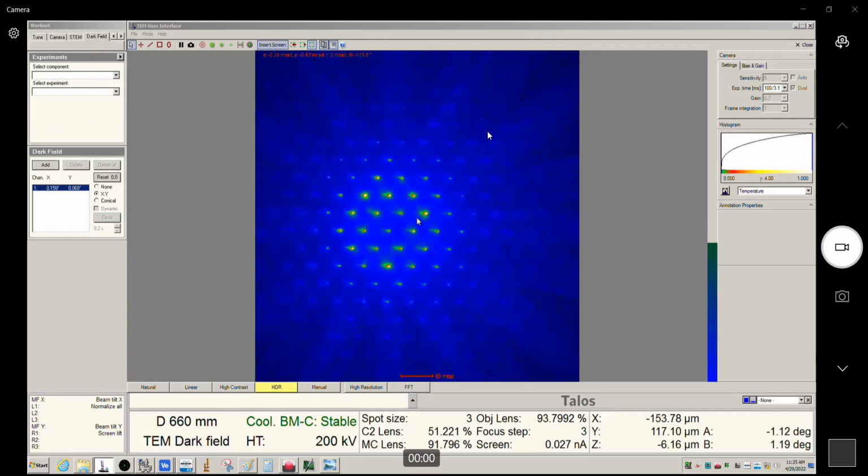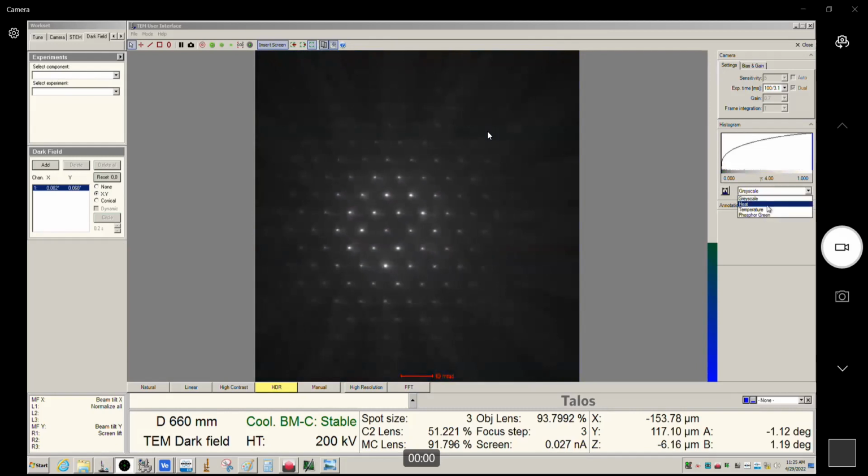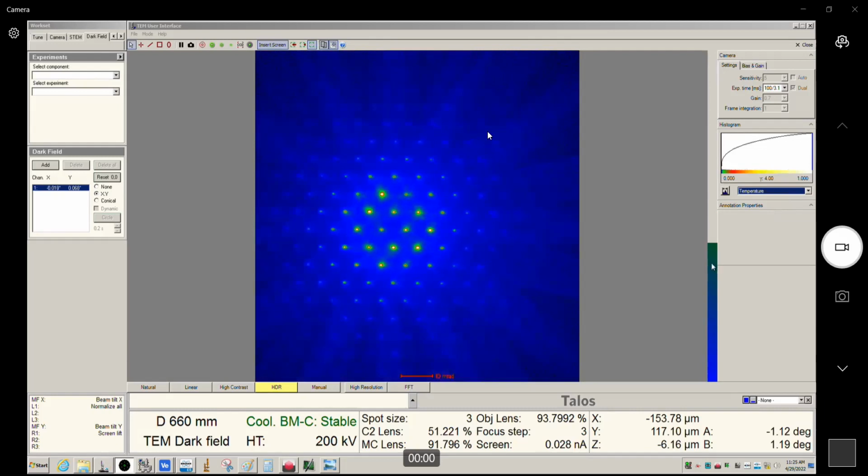Okay, right, so you can see here, I'm making it worse. I'm seeing a Laue circle here. There's my direct spot right there. Now the pattern is going to shift when you do this, so I'm going to go over how to get around that.